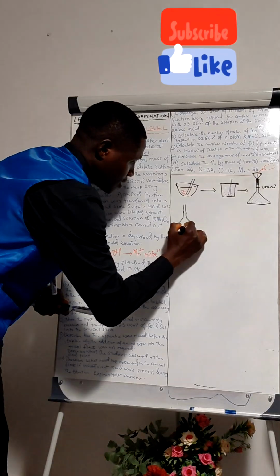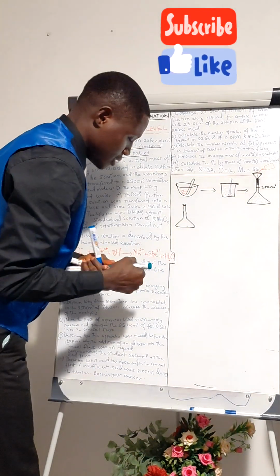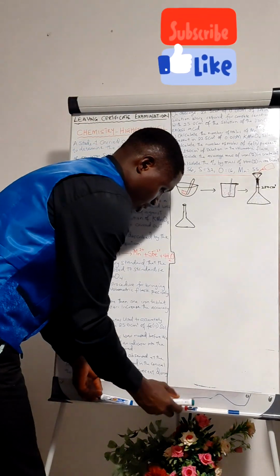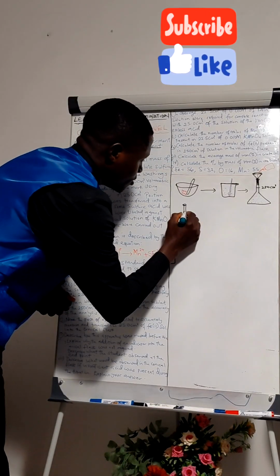After being inverted, we are going to have a complete dissolution of the iron(II) tablet.